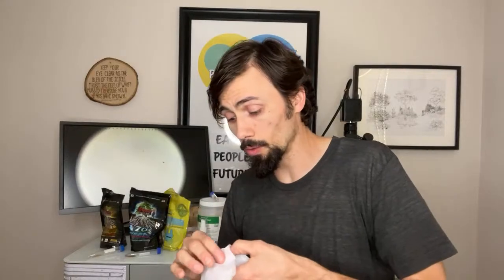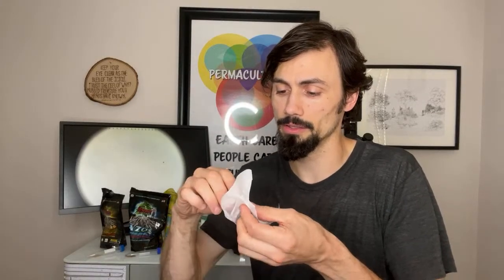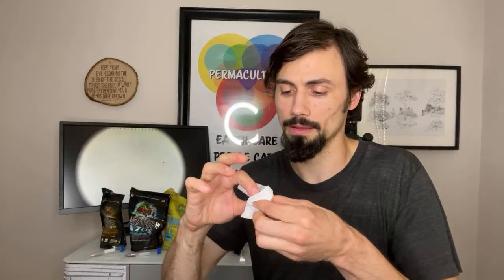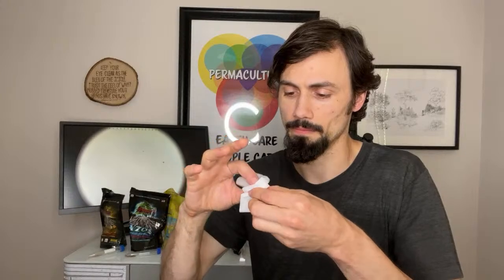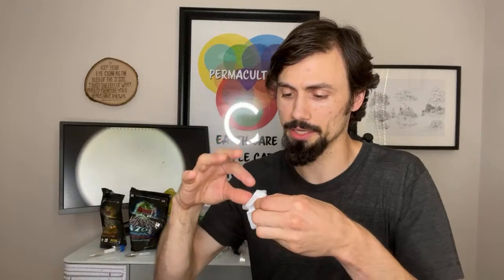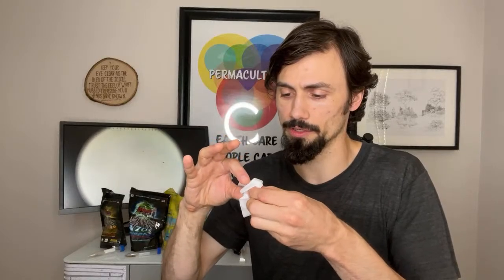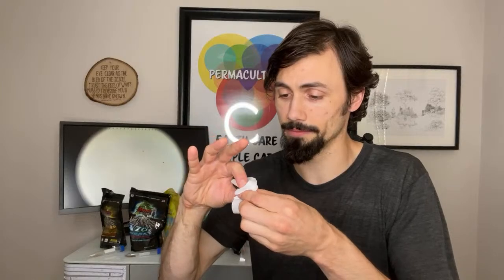All right, so this is the part where if you don't pay attention, you break it. I tend to pull in one direction and get all the moisture off first. The moisture will just ruin everything.